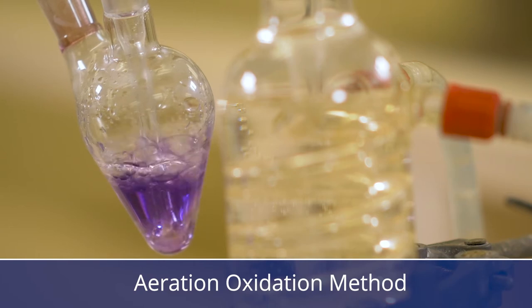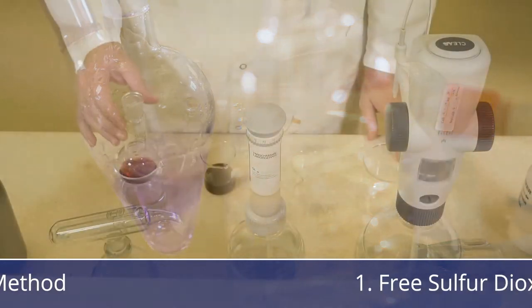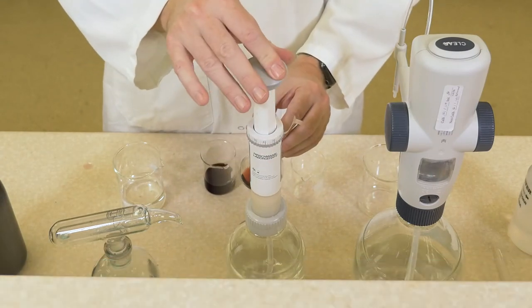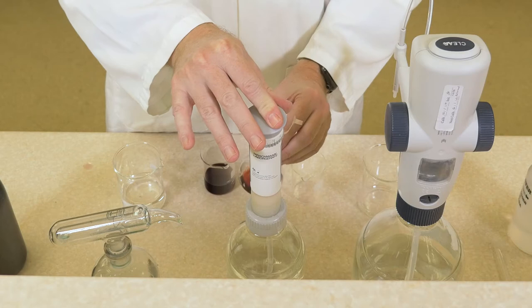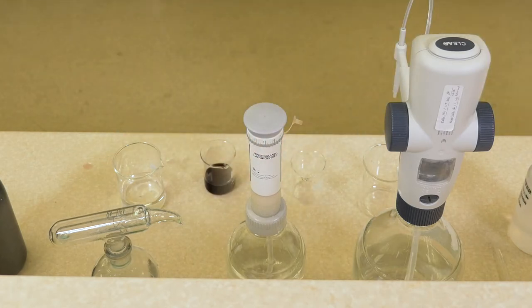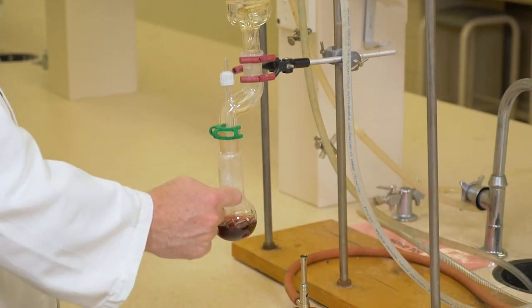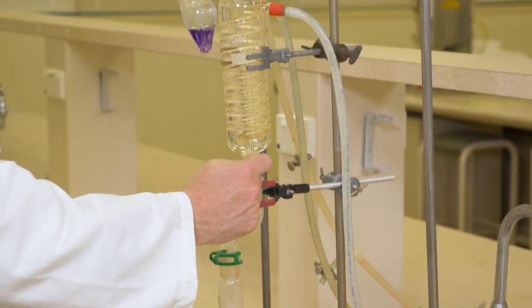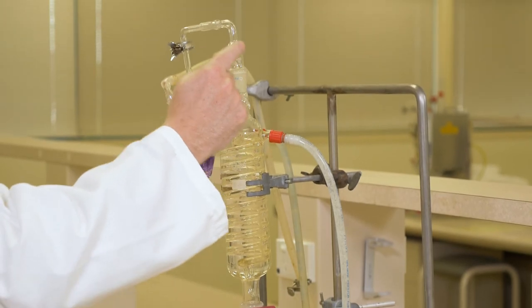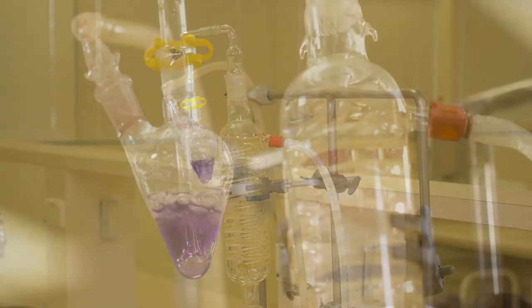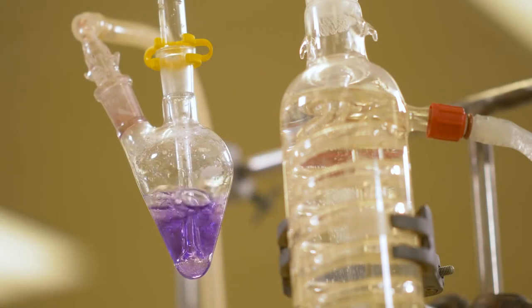The basic concepts are as follows. For free sulfur dioxide, a wine sample is acidified to shift all the free sulfur dioxide in solution into its molecular form. A stream of air is then bubbled through the sample to carry the sulfur dioxide from the wine up through a condenser to a solution of hydrogen peroxide. The hydrogen peroxide then reacts with the sulfur dioxide to form sulfuric acid.